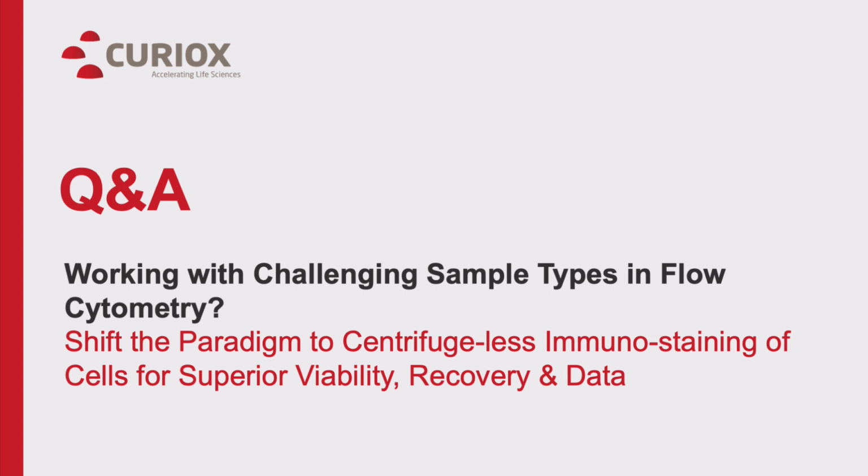Yes. Can you run less than a full plate? Yes, you can. So what you can do is, if say you want to run half a plate, just run half that plate. Then make sure there's buffer on the unused wells. Basically put it into a Tupperware container and put it in the refrigerator, and you can reuse the other side of the plate. Great.